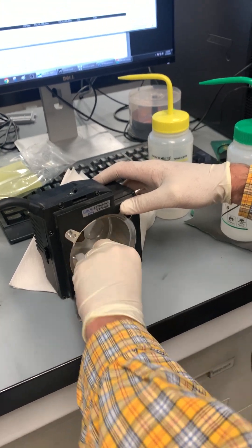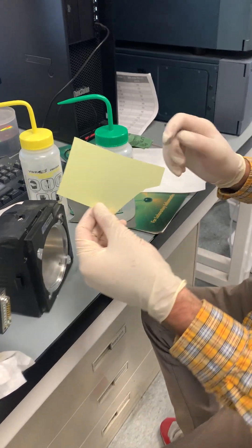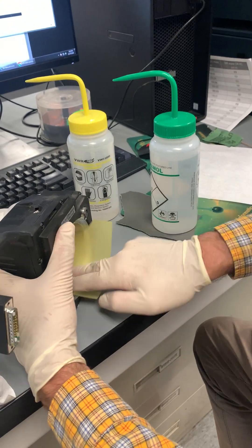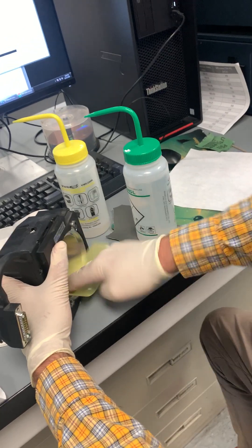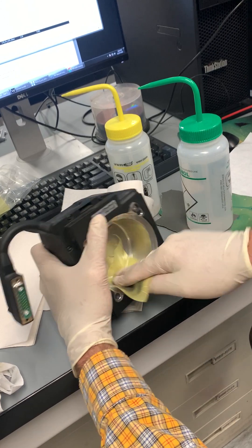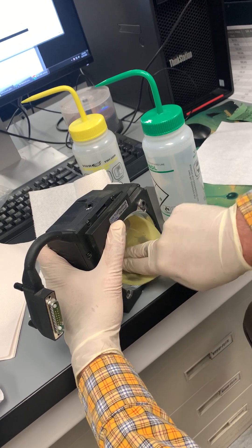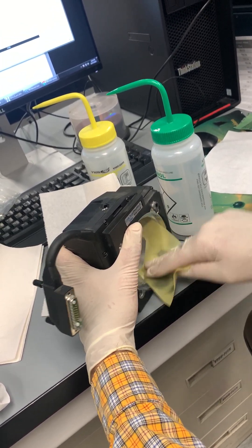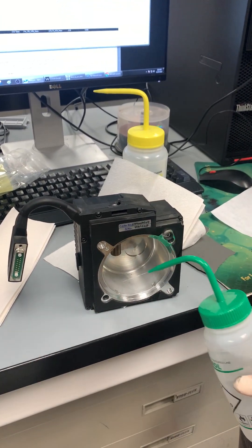Looks like it's pretty cleaned up now. Now to just polish it up with the lapping film. On the lapping film, you want to use the side that's not shiny — the more rough-looking side. That's really how you get the mirror finish. You can see it's starting to get really nice and polished up.